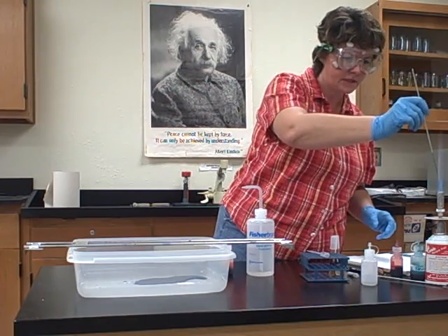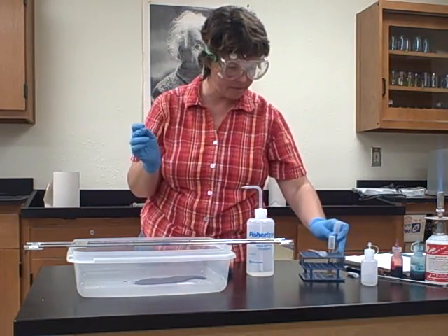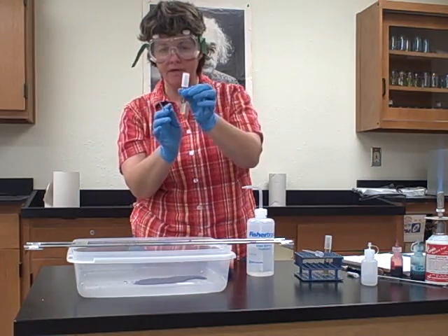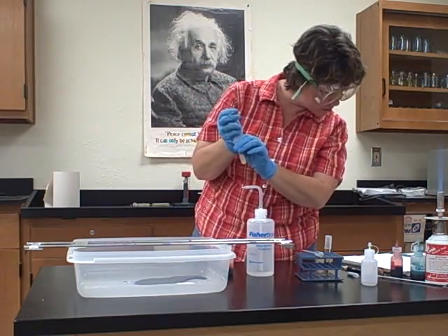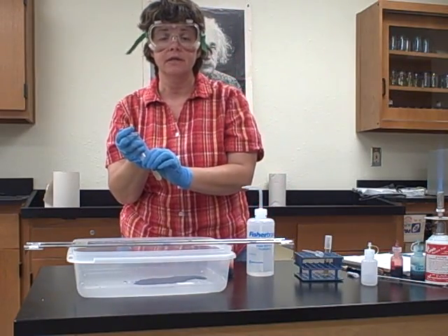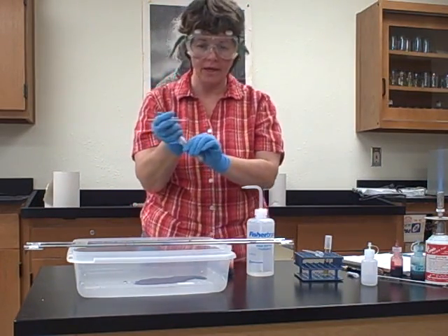Sterilize it because the Congo red is not sterile. Okay, so now that I've sterilized that, I'm going to get my bacteria, and remember I've got to let this cool off. So as it's cooling off, we're going to tap the bottom of our tube of bacteria, and I really have bacteria in here today. The 2 bacteria that we're going to use are S. salivarius and E. aerogenes. S. salivarius stands for Streptococcus salivarius, and you can imagine it's arranged in chains and it's circular. And salivarius means it comes from your mouth.